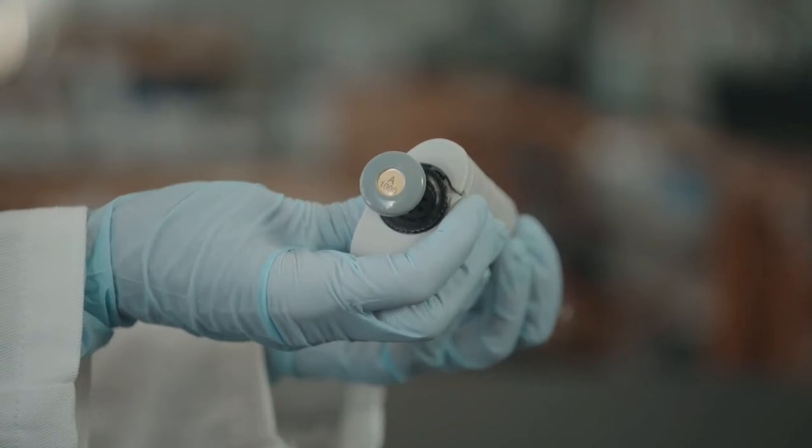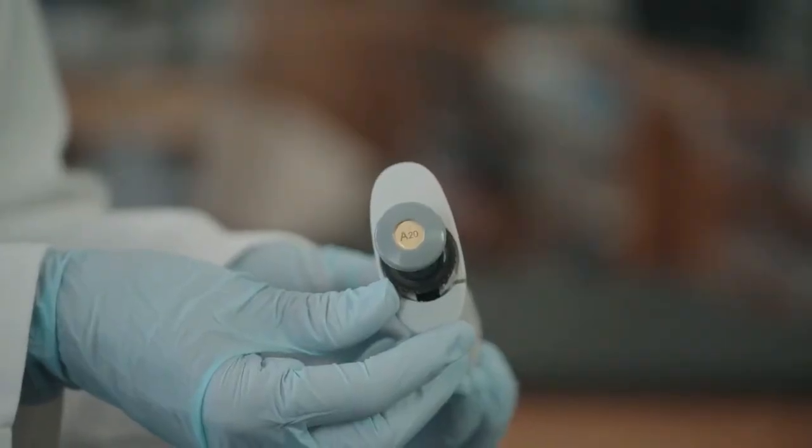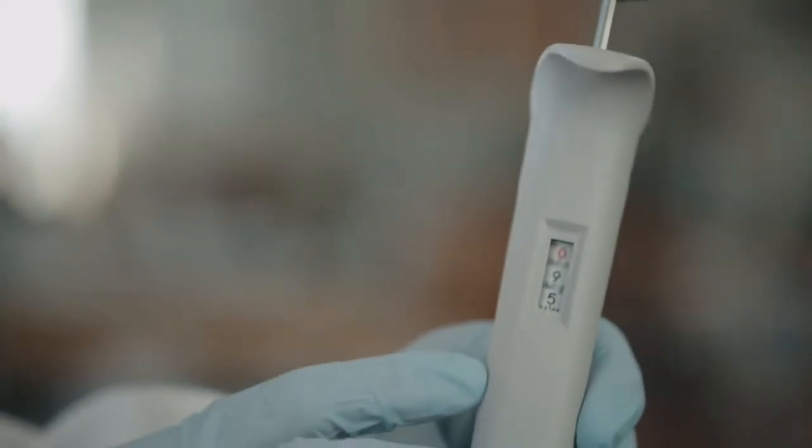It is used to measure volumes from 100 microliters to 1,000 microliters. This is a P20. It is used to measure volumes from 2 microliters to 20 microliters. This window on the pipette shows the volume of fluid that the pipette is set to take up.